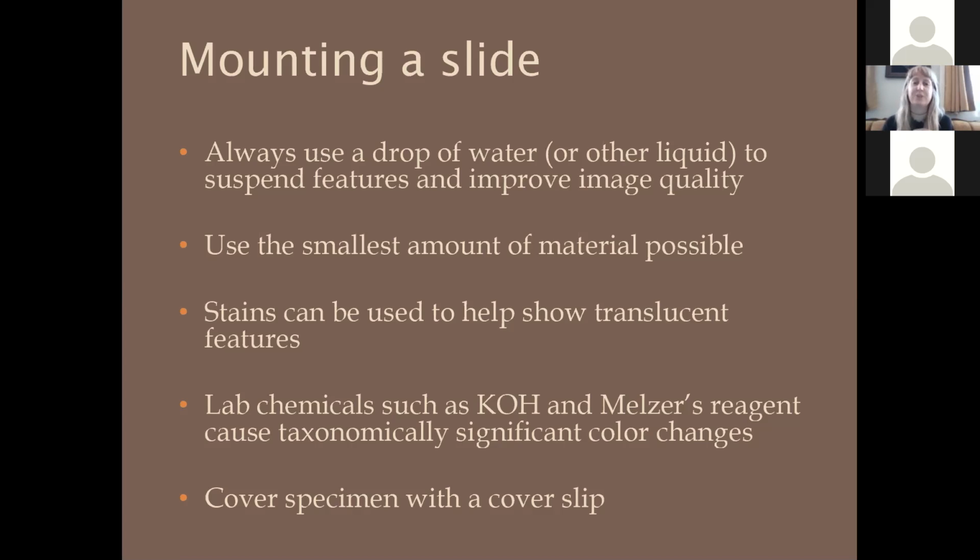So you don't necessarily want to mount everything in potassium hydroxide because there are features that could disappear or explode with the potassium hydroxide. That doesn't happen for most features, but there are cases in which it would affect what you're looking at in a way that might change your perception of the ID.